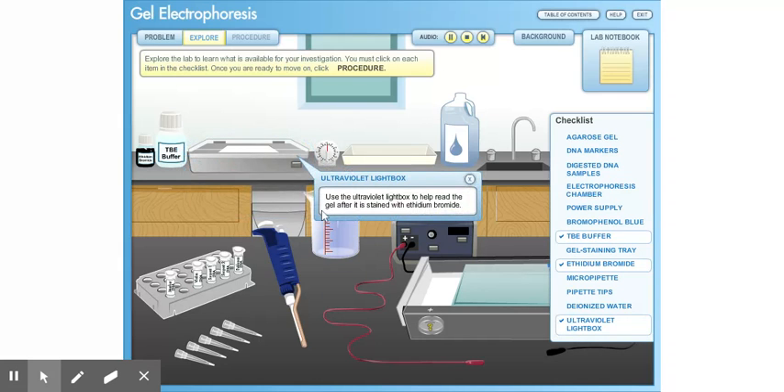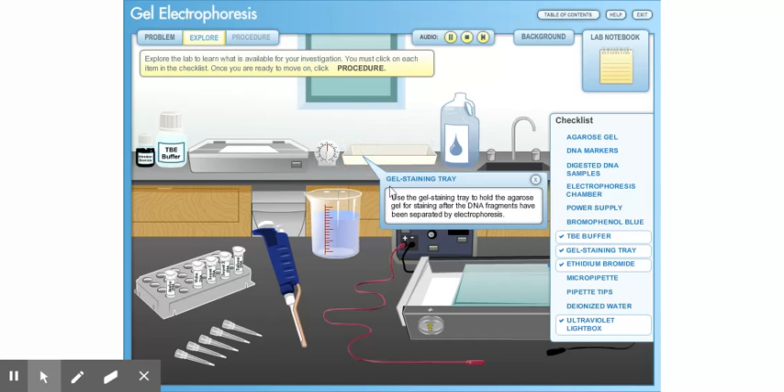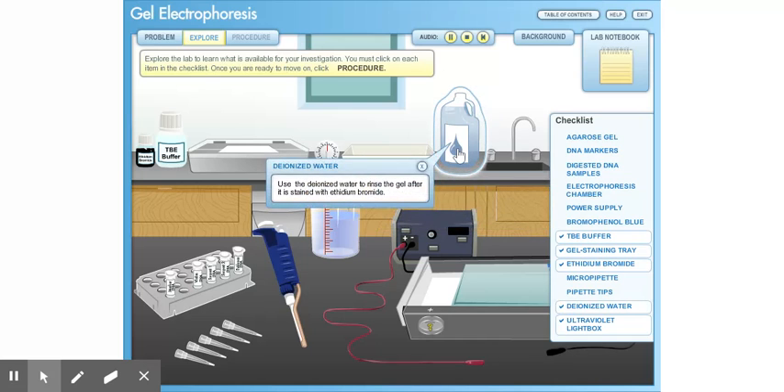Use the ultraviolet light box to help read the gel after it is stained with ethidium bromide. Use the gel staining tray to hold the agarose gel for staining after the DNA fragments have been separated by electrophoresis. Use deionized water to rinse the gel after it is stained with ethidium bromide.